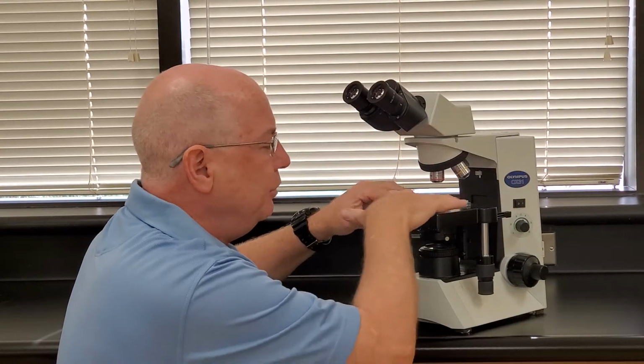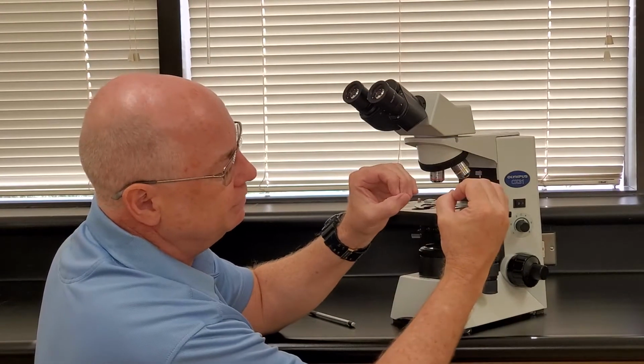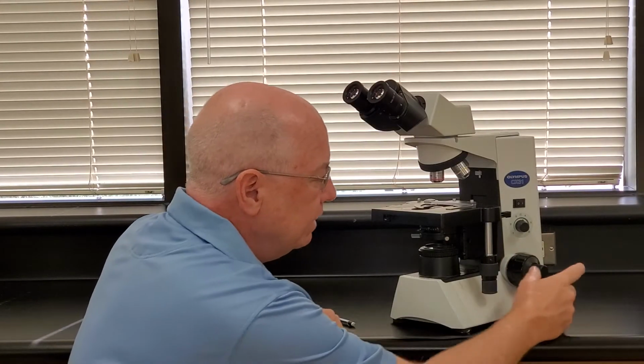Then you're going to mount your slide, and then looking from this angle, you're going to center your slide by turning the stage control knobs so that the cover slip on your slide is sitting over this condenser lens. Now I know what I want to see is in the tube that I'm looking through. Problem is, it's so far away we would never see it. So then, the next step would be to raise our stage.